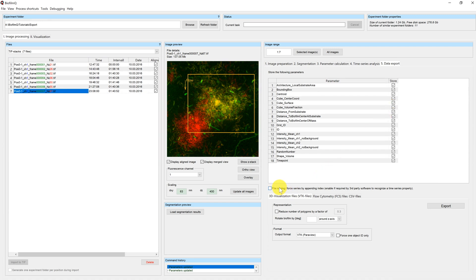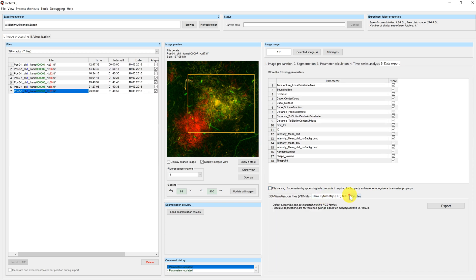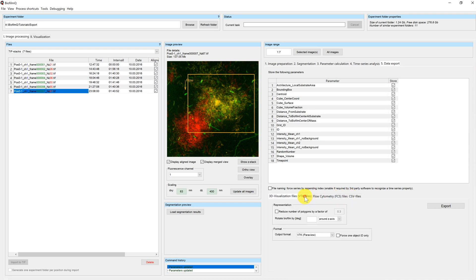Below the table you can find the checkbox 'file naming.' If you enable this option the file name only consists of the frame number. This option was necessary since some third-party programs require the frame number to be the only index in the file name for recognizing time series.